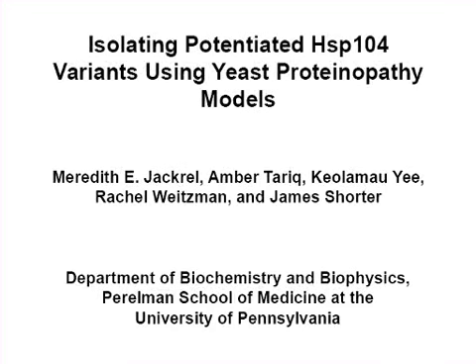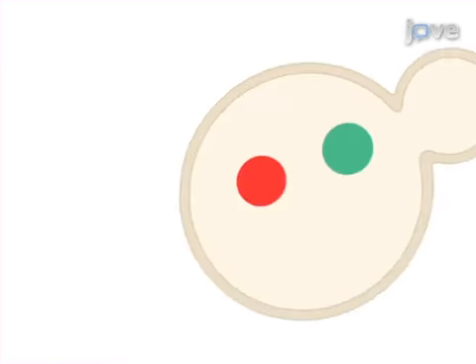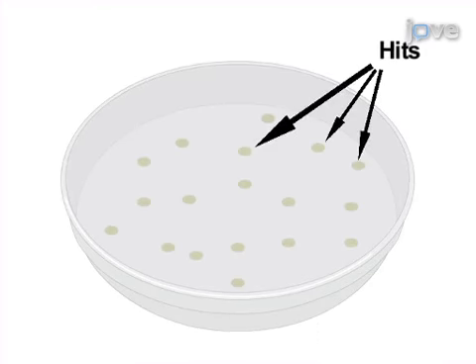The aim of the following experiment is to screen Hsp104 libraries for the selection of variants that suppress the toxicity of the proteins associated with protein misfolding disorders. This is achieved by co-transforming Hsp104 variant libraries with a disease-associated substrate in yeast and co-expressing the two proteins.